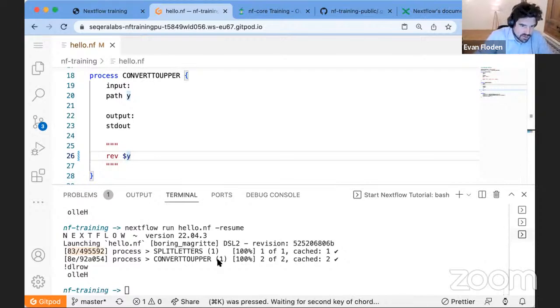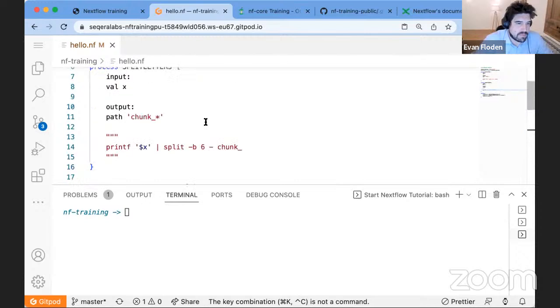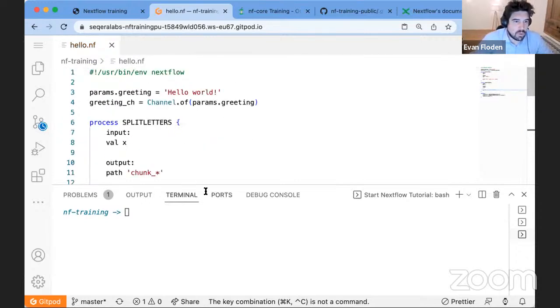Okay, so far this pipeline that we're running is simple enough, but it's only running this hello world piece. What happens if I wish to change this now? If I wish to update this, so I'm not just running hello world, but I want to run it on my own data. Maybe I've got my own data. I come around, you've given me this pipeline, or we should run them this way.